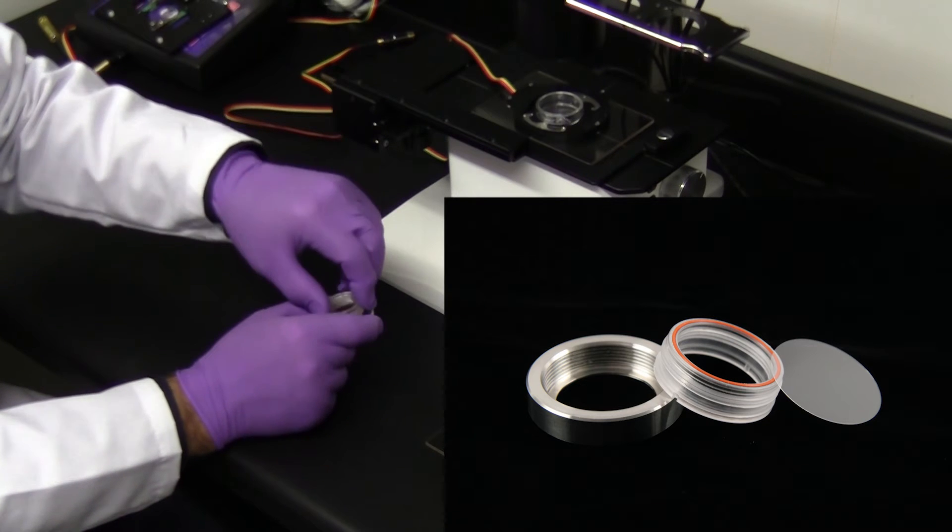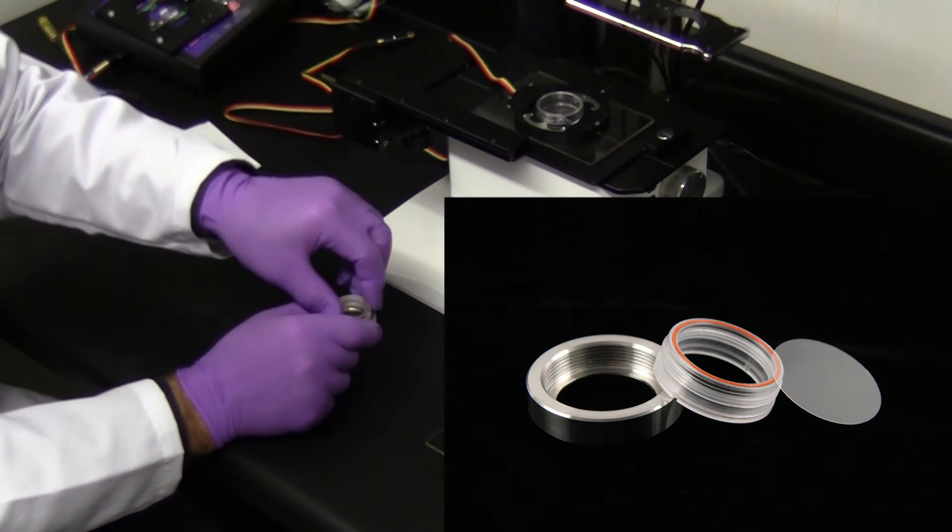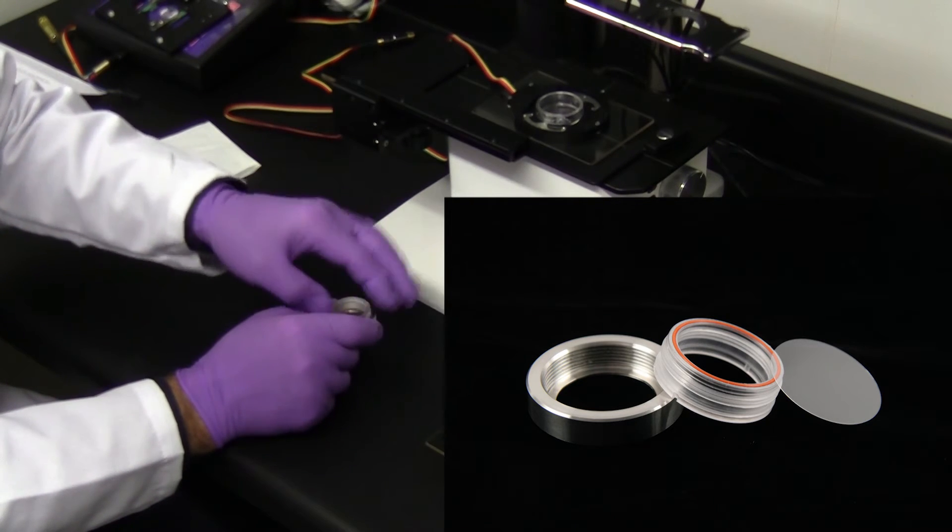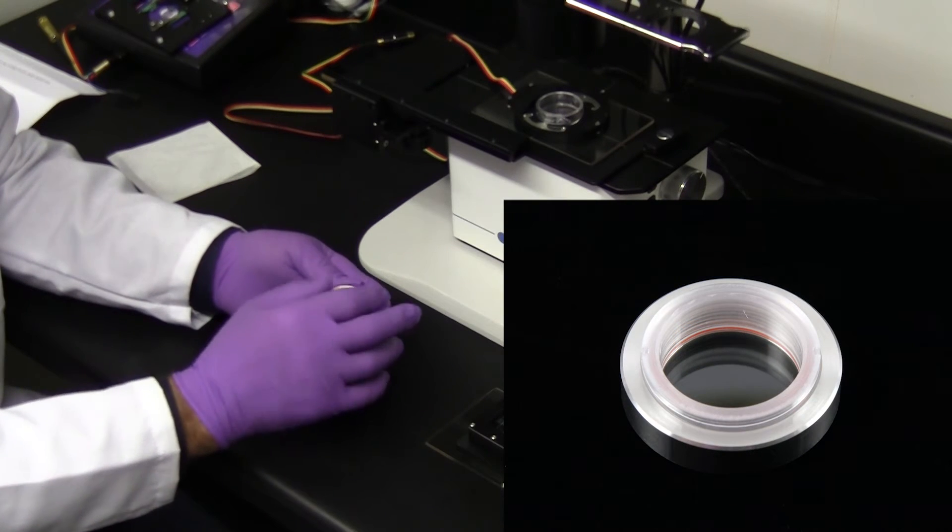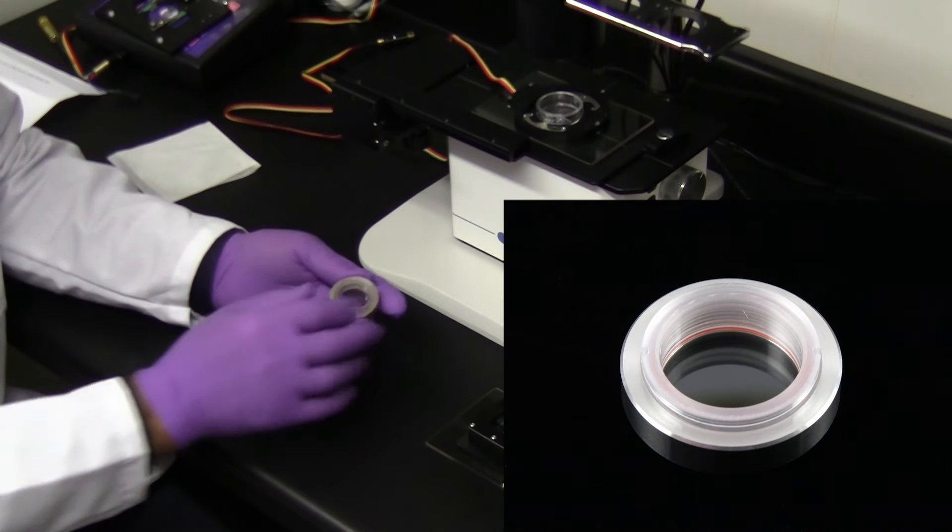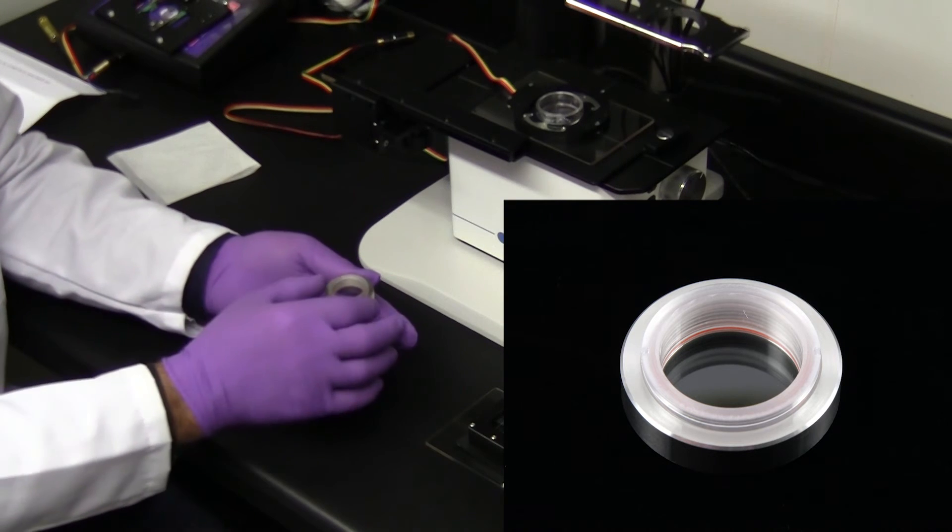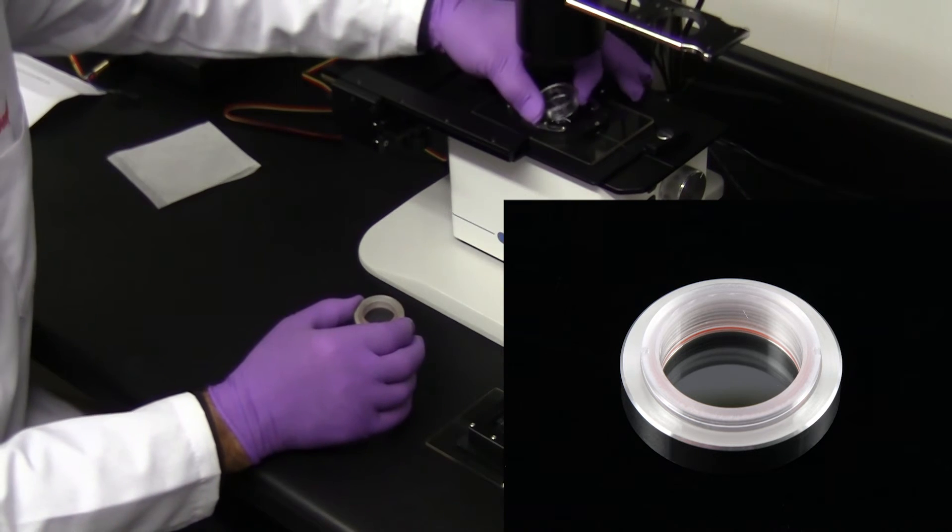The coverslip is retained by a polycarbonate threaded sleeve, having an O-ring making contact with the cover glass. Therefore, media never touches the metal. It is fully autoclavable, and customers can make their own coverslip bottom dishes for only the cost of a coverslip.